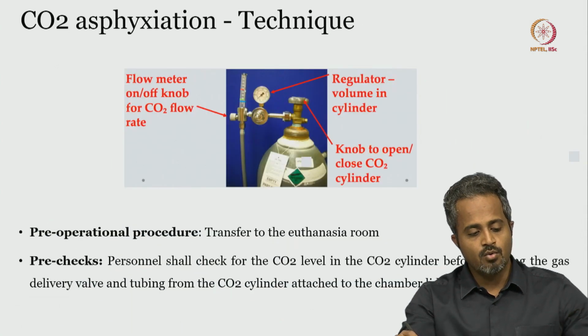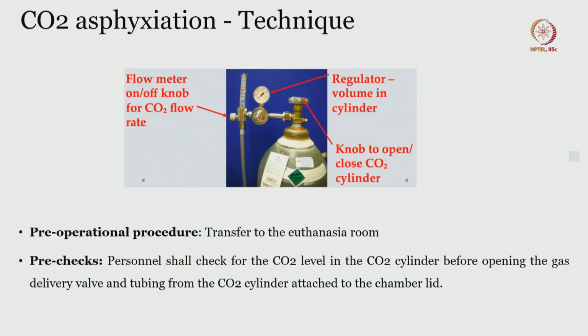All right. So, how exactly are you going to deal with the carbon dioxide asphyxiation technique? Here you will be handling the carbon dioxide cylinders. All right. It is very important that you familiarize yourself with the different parts of the carbon dioxide cylinder, then the job becomes easier.